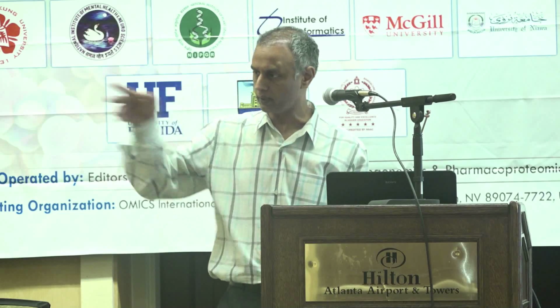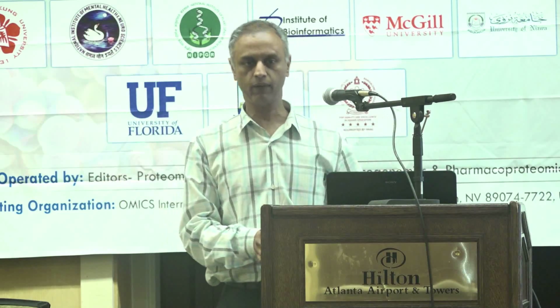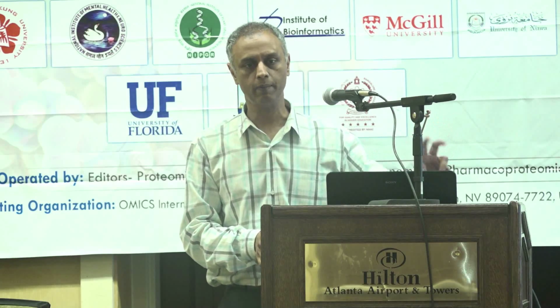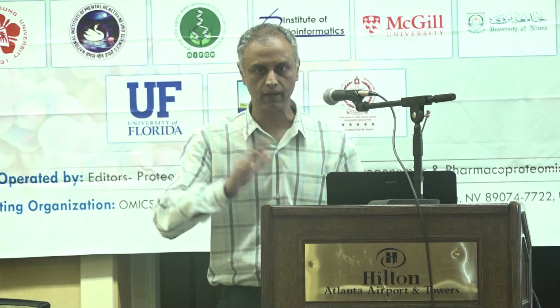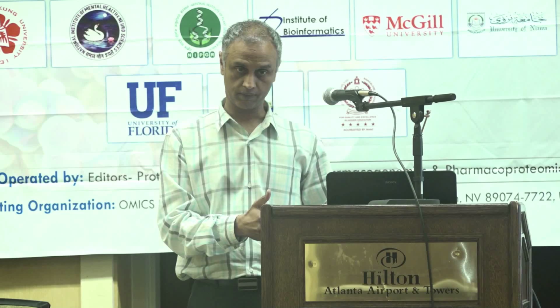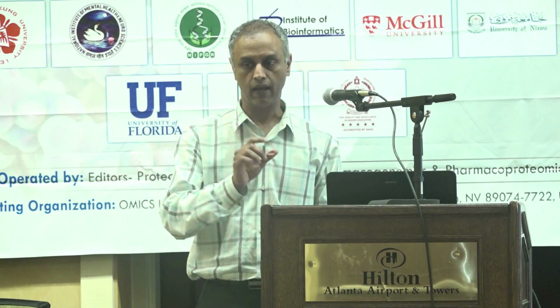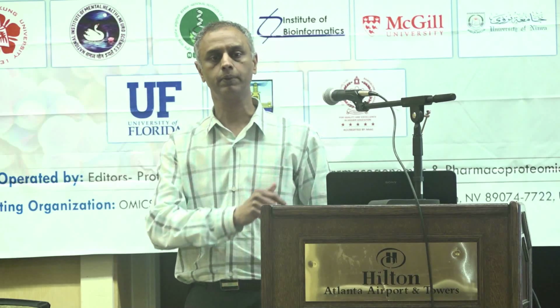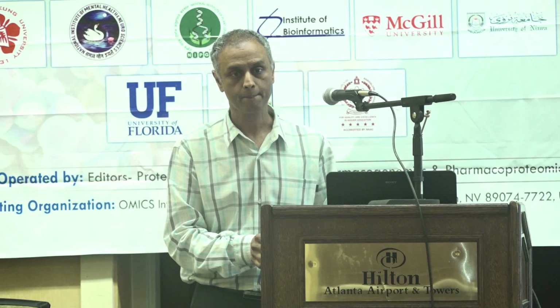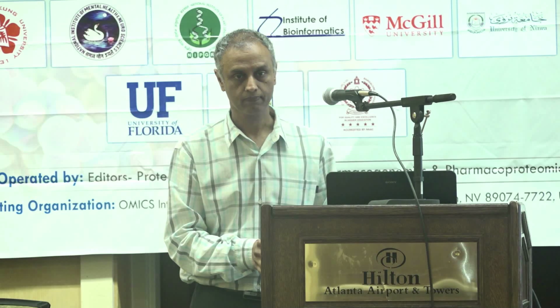All we told them was it matches to this particular strain of E. coli. Then they went back to their notes and they said, aha, we think this is where we made the mistake. They had a morphological observation, it was more slimy, and based on the phenotypic characteristics, they identified it as Klebsiella. And they said it does fit this particular subtype of E. coli. Were those sensitive to that antibiotic?